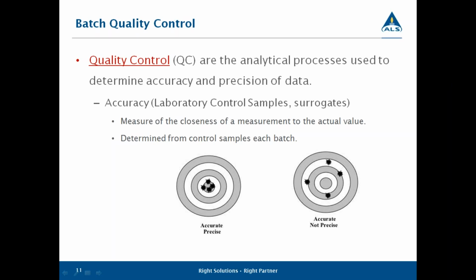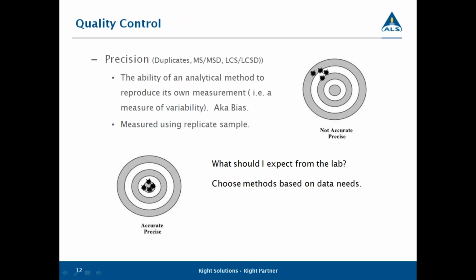Many of you have probably seen these bullseye representations, trying to differentiate accuracy from precision and so forth. You can see the target there, if you can envision the holes as being results. On the left there, we have excellent accuracy and precision. We're right on the bullseye, and they're grouped nice and tight. However, on the right, we're fairly close to the bullseye, but the results are scattered all over the place. So precision is bad. On the upper right there, we have very precise, nice tight grouping.